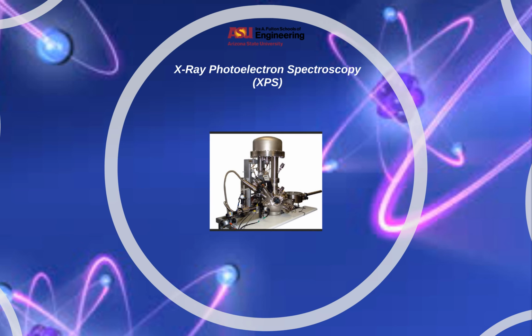The X-ray photoelectron spectroscopy VG220iXL is the model of XPS used in our lab to retrieve the data. This is a picture of the XPS machine used for our experiment.